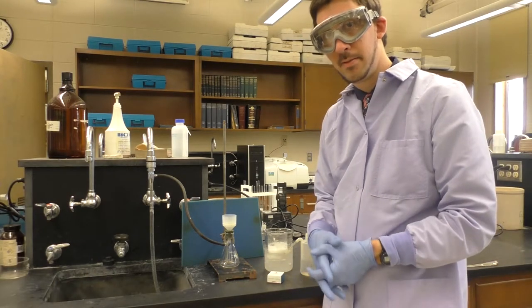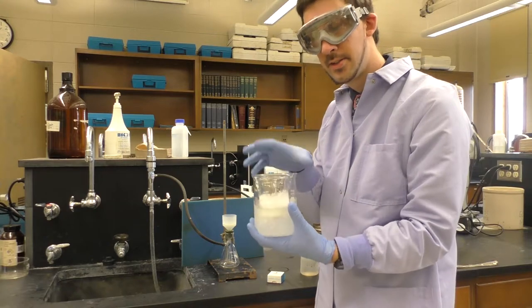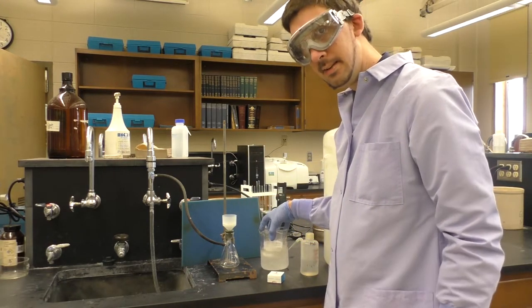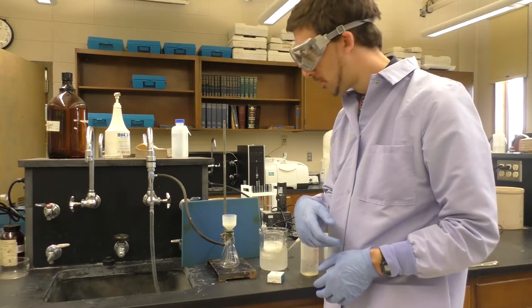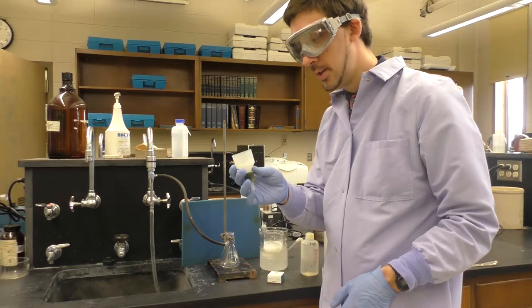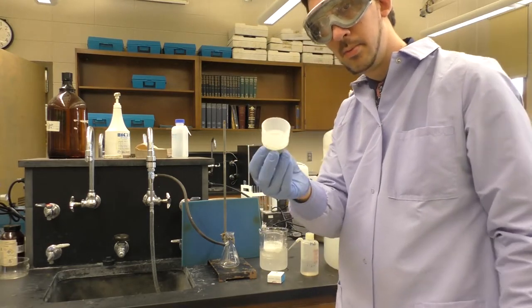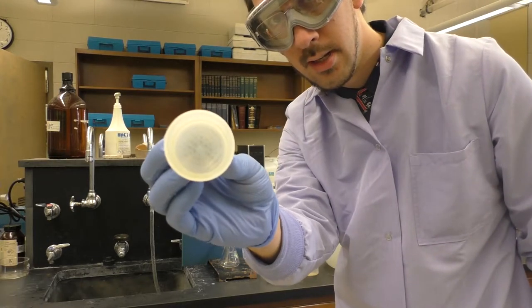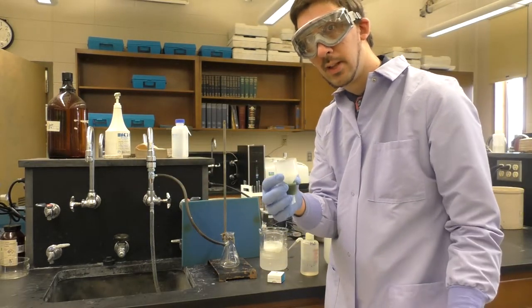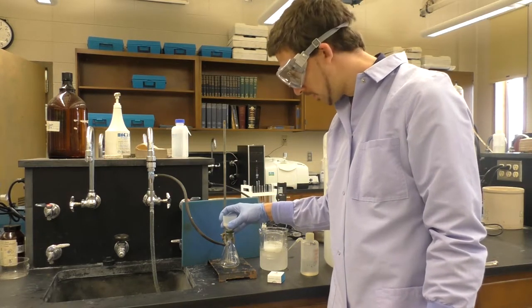So here I am at the filtering station. I've got my crude product here still in the ice bath. And I have a slightly different funnel setup than we've done before. This is known as a Buchner funnel, not a Hirsch funnel. Rather than being conical, this one is a little bit more flat and uses a larger filter paper. So this is good for slightly larger scale filtrations like we've got here.